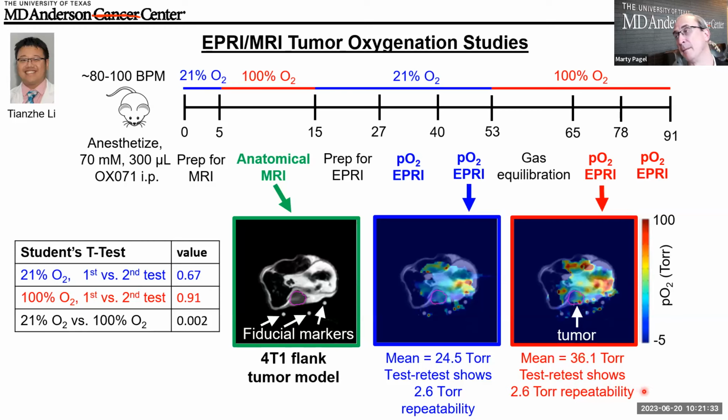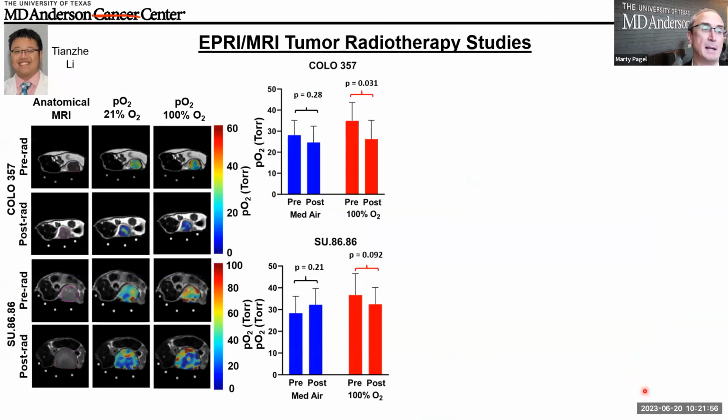And that is outstanding because I hardly ever see 10% precision in small animal imaging. PET imaging can get down to that level if you're very careful. Even optical imaging doesn't quite get below 10% very often, unless, again, you're very careful with your positioning of the mouse and so on. So this EPR instrument, I find, is very reliable.